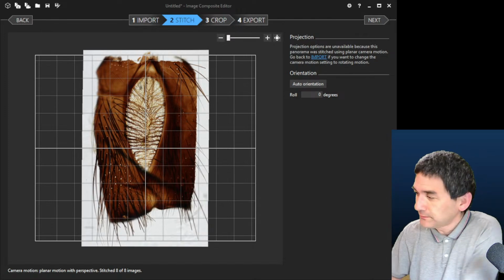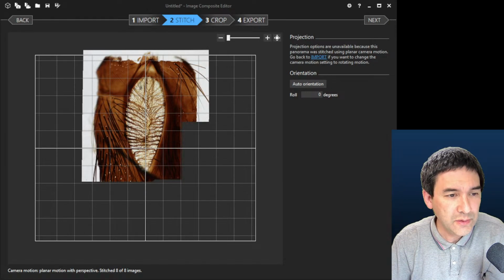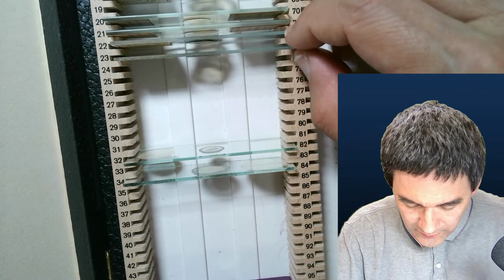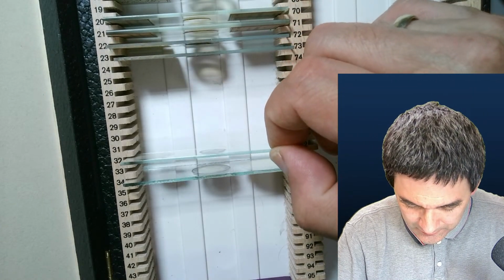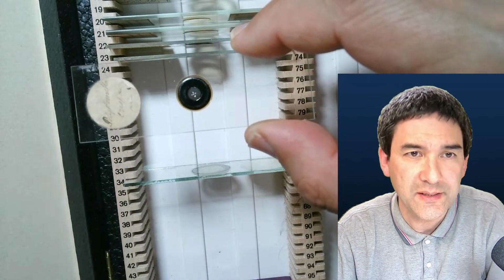Right now, what I would like to do is move back to the desk view. I think I'm pretty much through. I've now shown you all of the insect slides. However, there are two slides that I did not show you yet last time.